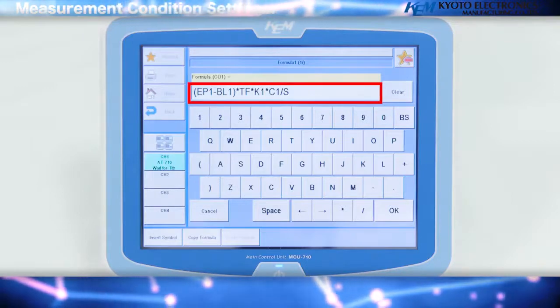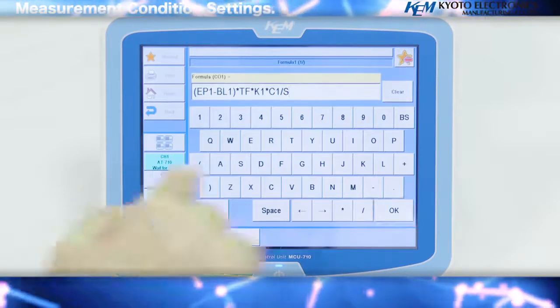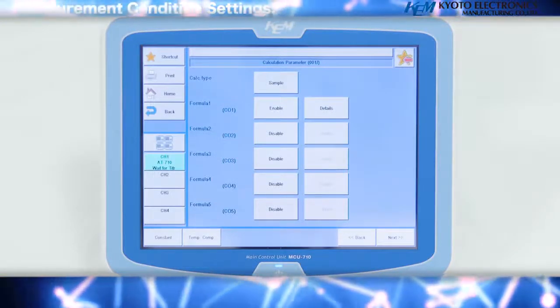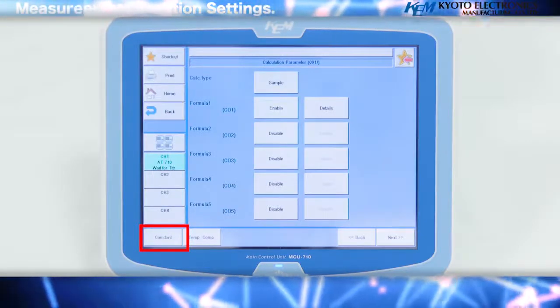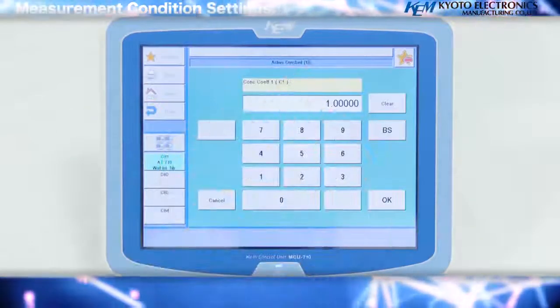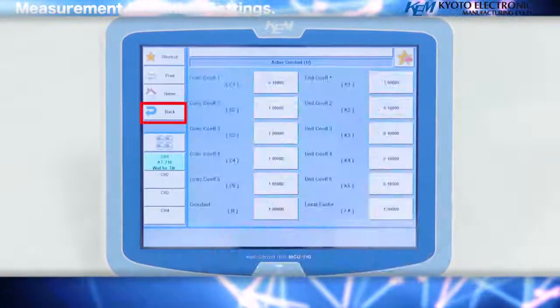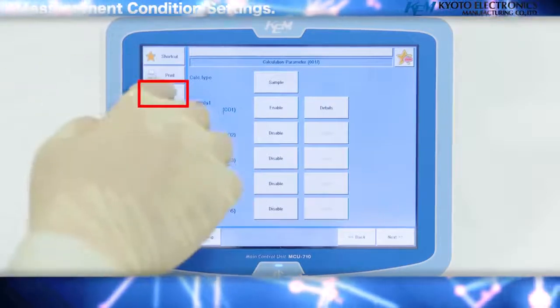The calculation formula is as follows. Note that it is also possible to include arbitrary numbers. Press the back key after having selected OK to return to the calculation parameters screen. Depending on the acid being used, you must select a constant. Press the constant key, select concentration coefficient 1, and press the OK key. Press the back key to return to the previous screen. When all the settings have been made, press the home key.